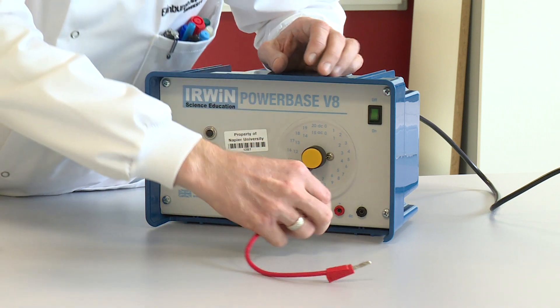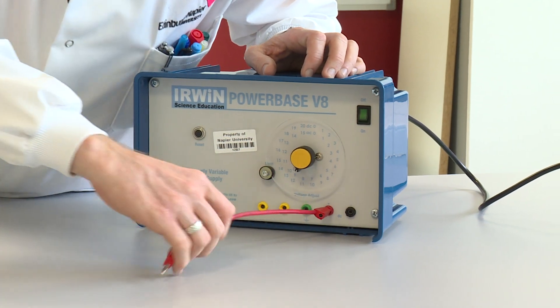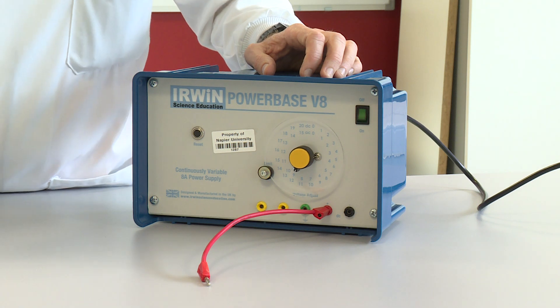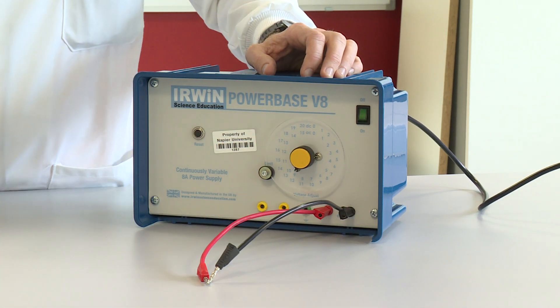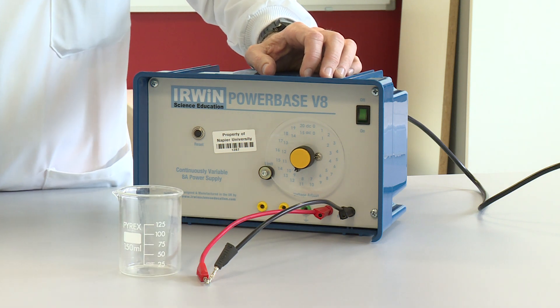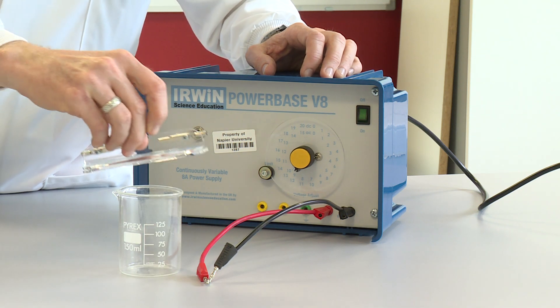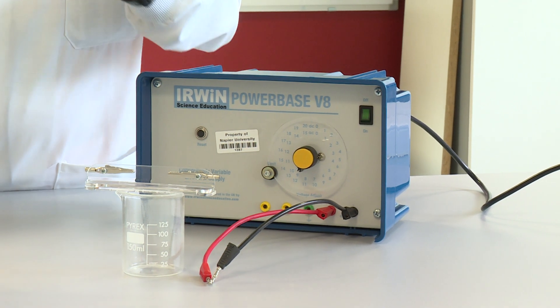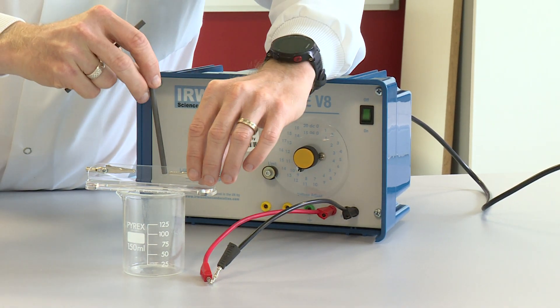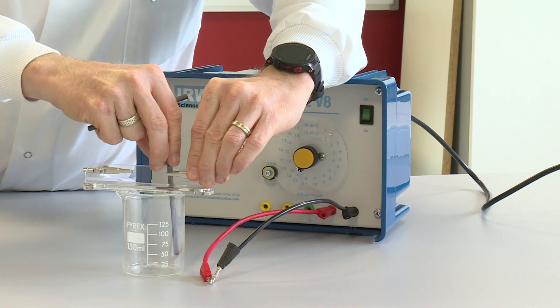I'm going to put one wire into the red socket of the DC supply, another wire into the black socket of the DC supply, and I've got my electrode holder which is going to sit on top of the beaker, and I've got my carbon electrodes that I'm going to hold in place with the crocodile clips.